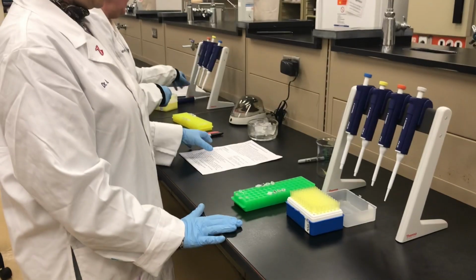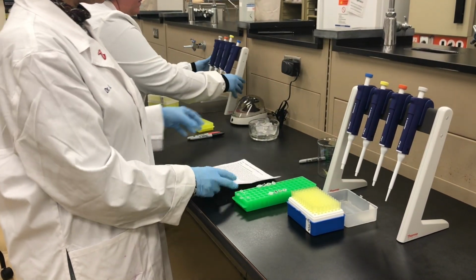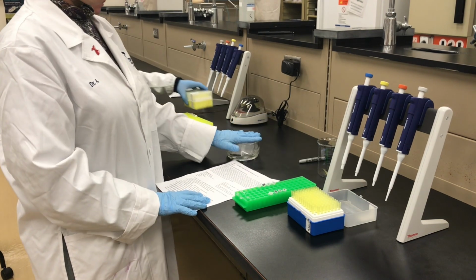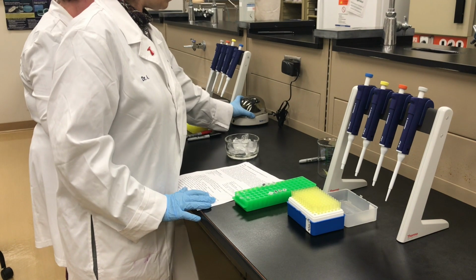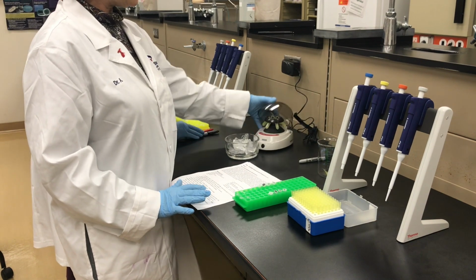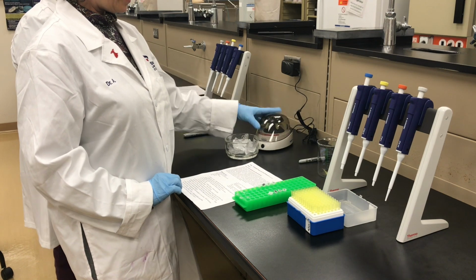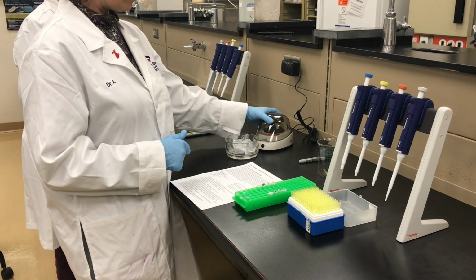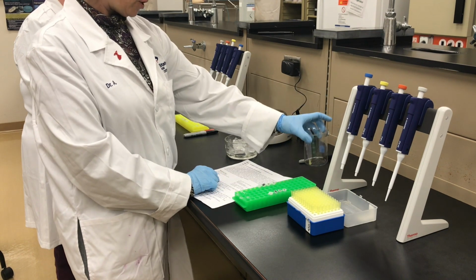And let me show you the equipment we've got out. So what do we need? We have an ice bowl because some of these reagents should be on ice while they're being used. We have a microcentrifuge. We can put in 6 of the little tubes and spin them to get all the liquid down to the bottom. We've got a beaker for trash.